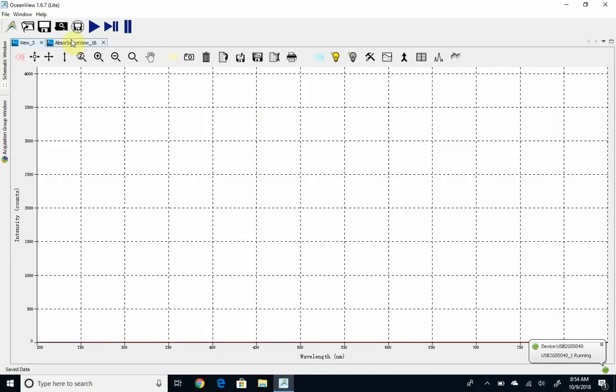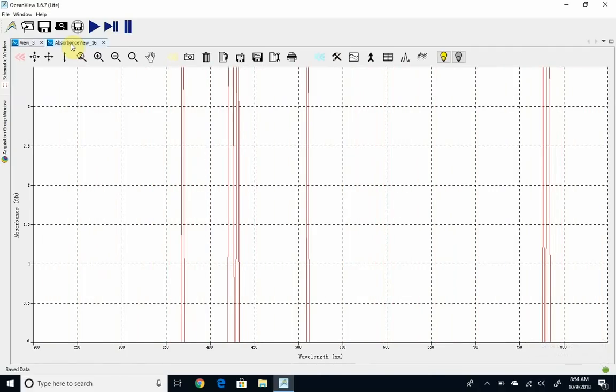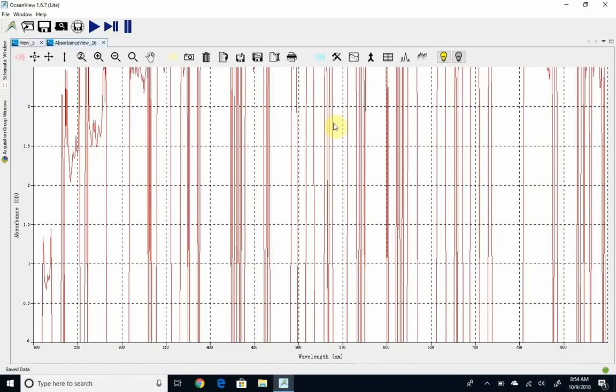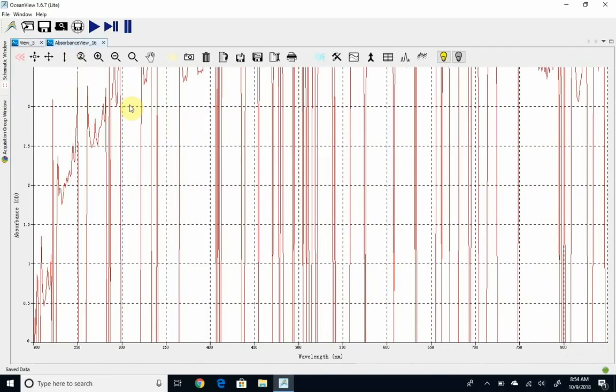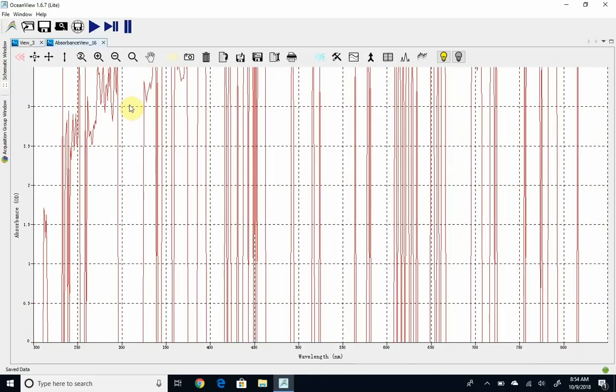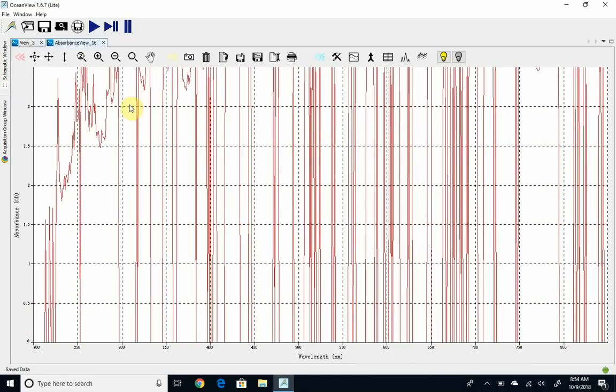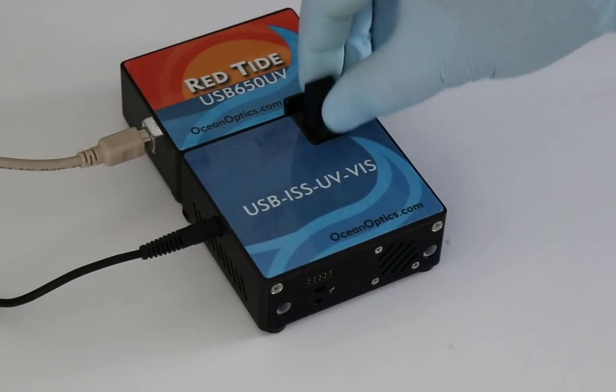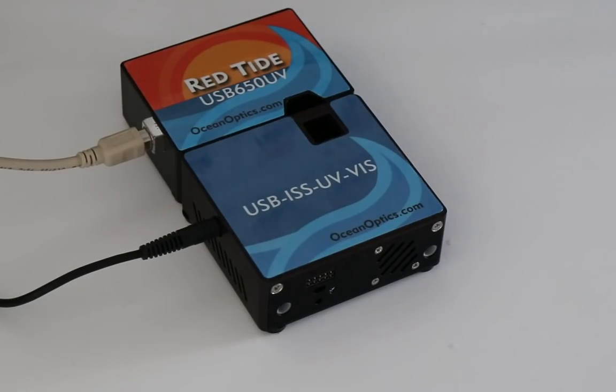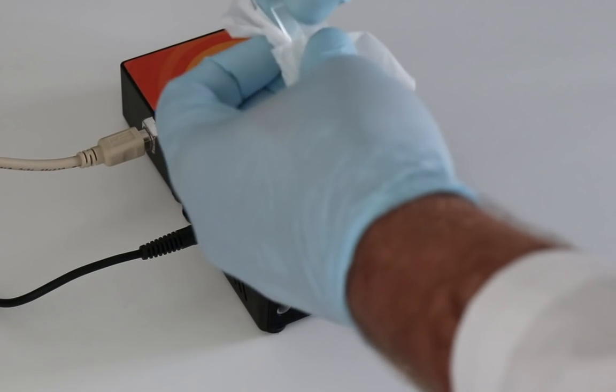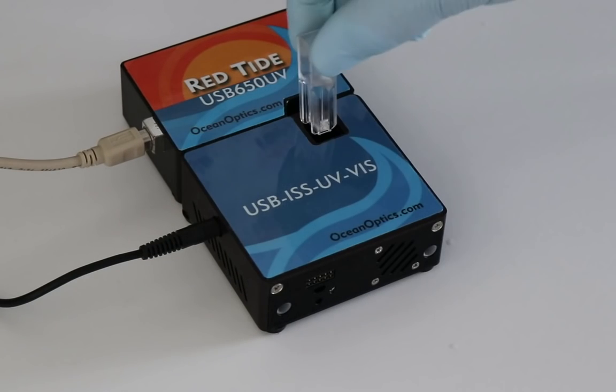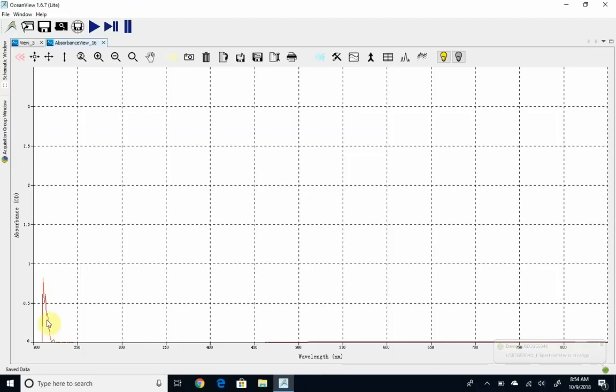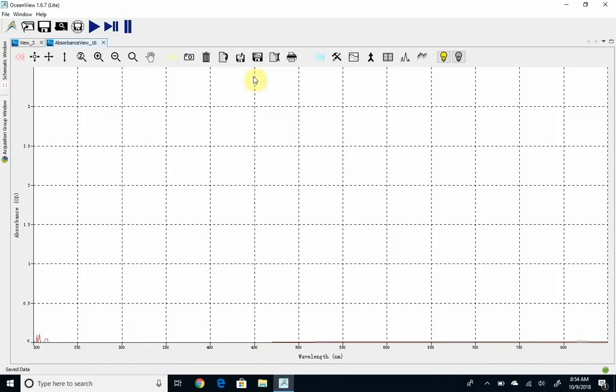Now you can switch to the absorbance view window. This is the one we're going to be working with most of the time, and you'll see that there's just a ton of noise. That's because the black plastic plug is in there and there's no light getting to the detector. I'm going to pull that out and put back in my blank, my deionized water, making sure the black or the triangle on the top is facing front, and you'll see it's very low absorbance, so almost no light absorbed.